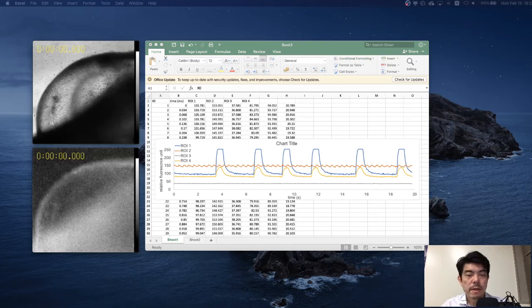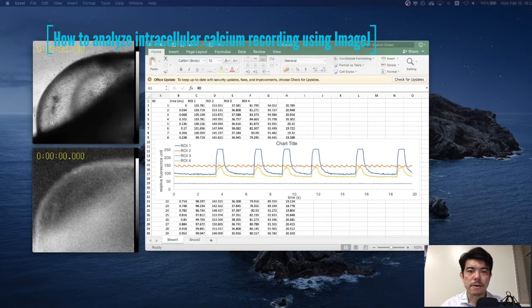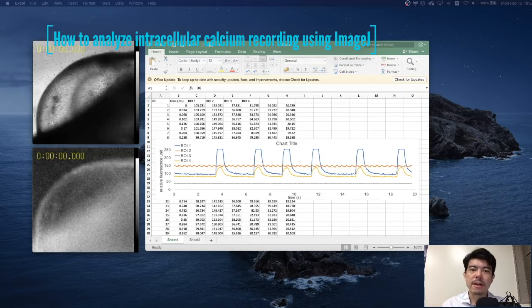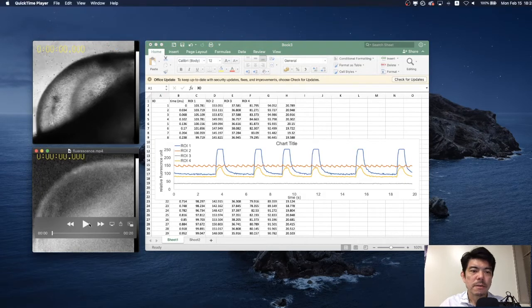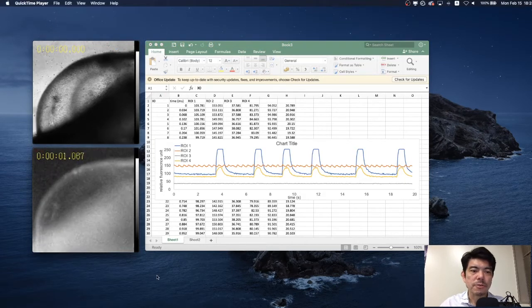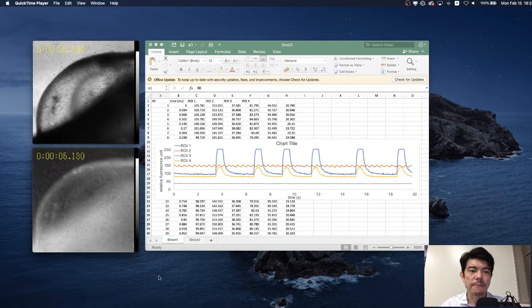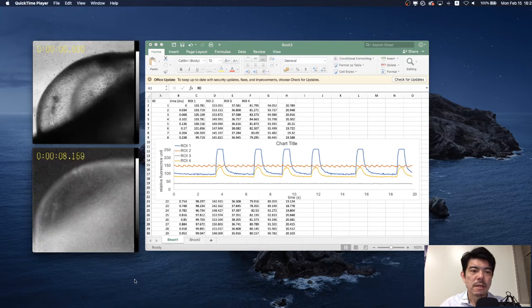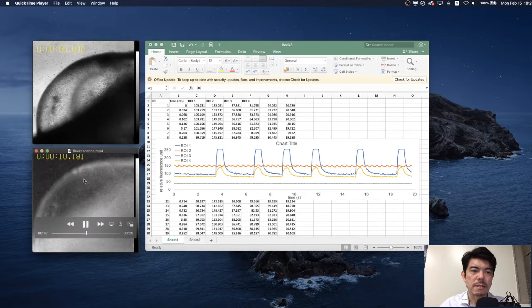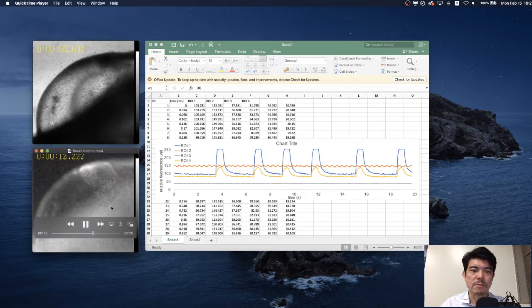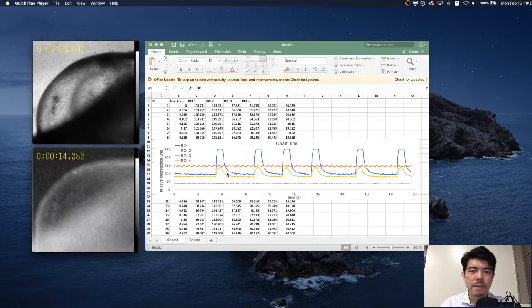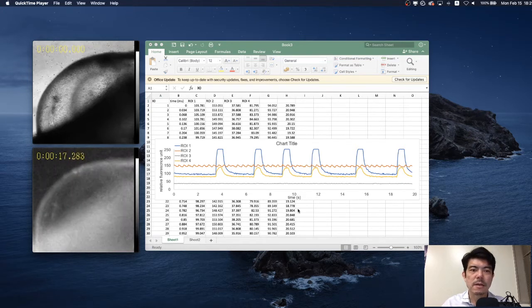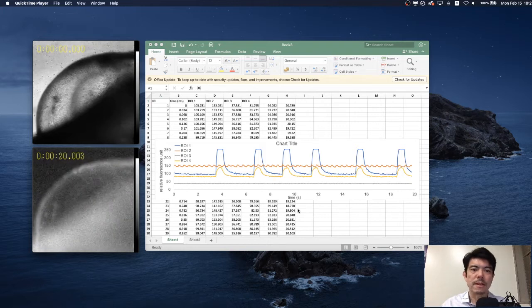Okay, today I'm going to show you how to analyze the fluctuation of the intracellular calcium level using ImageJ. Here we have the recording of the intracellular calcium level from some sample. Here we can see the nice fluctuation of the intracellular calcium level and this is the final result of the analysis. Today I'm going to show you how to do this analysis using ImageJ.